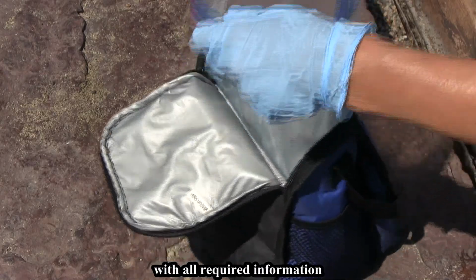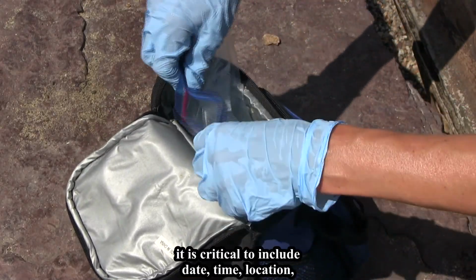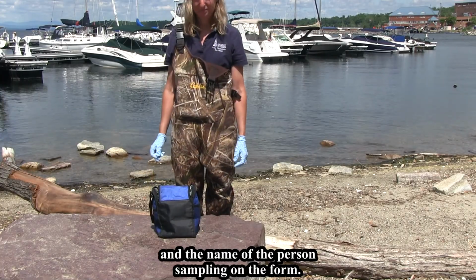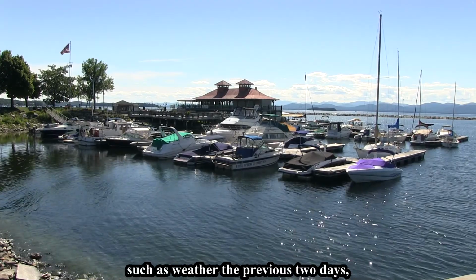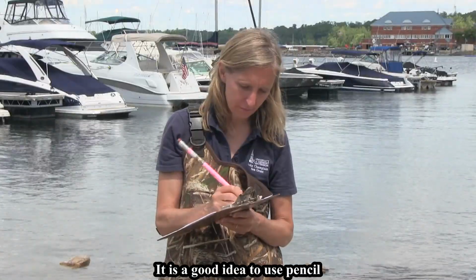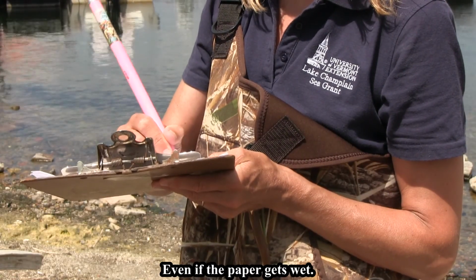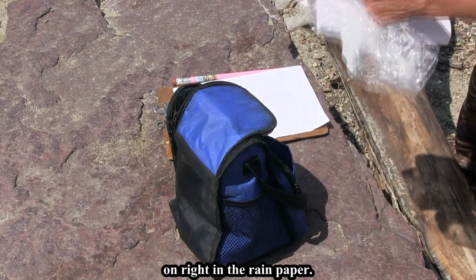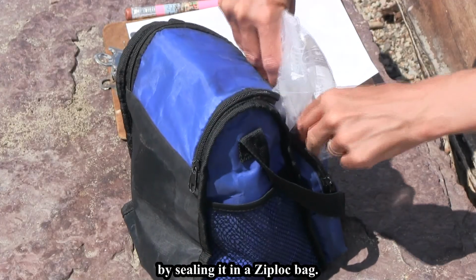Complete your data sheet with all required information. It is critical to include date, time, location, and the name of the person sampling on the form. It is also important to note field conditions such as weather the previous 2 days, current weather, and site conditions. It is a good idea to use pencil to complete your data sheets, as that will hold even if the paper gets wet. If possible, print your data sheet on Write in the Rain paper. Finally, protect your data sheet from your sample by sealing it in a Ziploc bag.